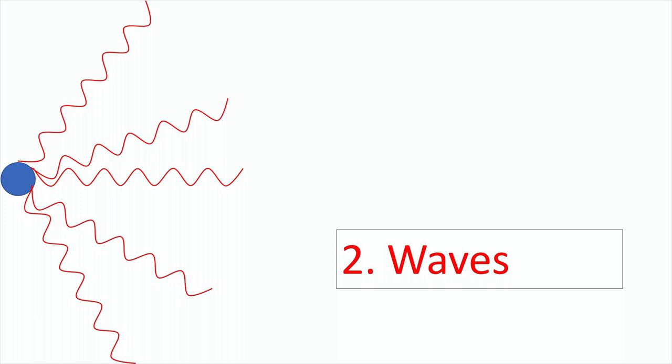Showing light in this classical presentation of waves makes very clear that light possesses qualities of waves. We'll be using this representation of light later on, as it is very helpful in demonstrating what happens when waves of light interact with each other, leading to image formation.